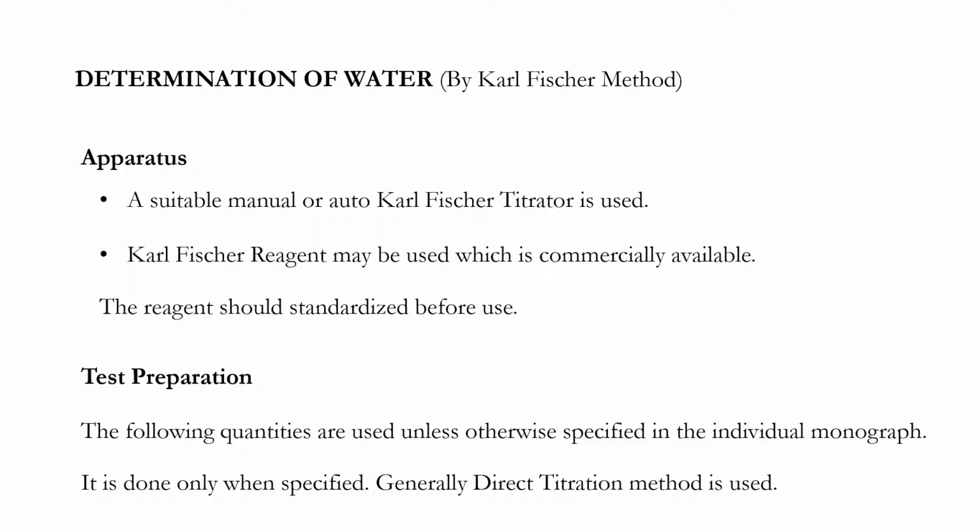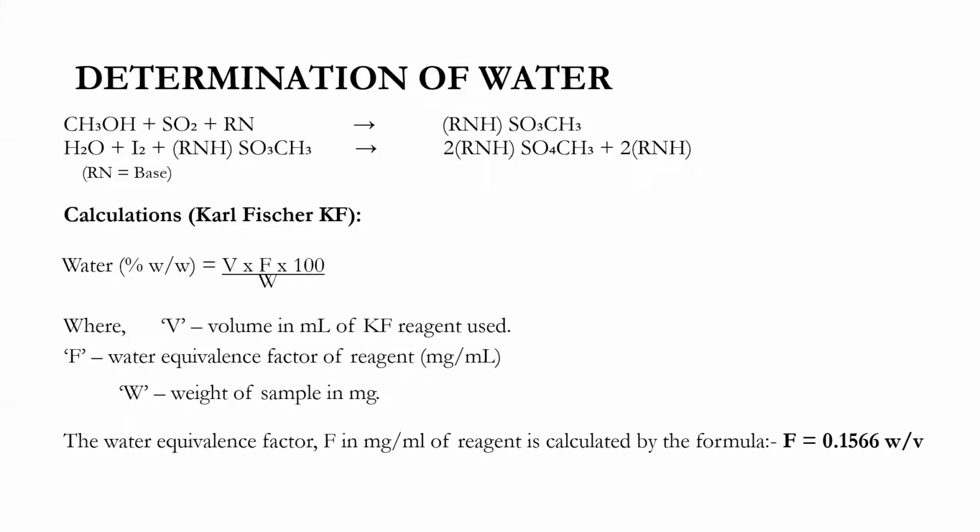The apparatus, like a suitable manual or an auto Karl Fischer titrator, is used for determination of water in the tablets and in the capsule. Here the Karl Fischer reagents should be utilized, and every time we are going to use them, they should be standardized. Here you can see how we are exactly calculating. This is a calculation by using the reagent only, and the reagent is the Karl Fischer reagent, that is KF reagent.